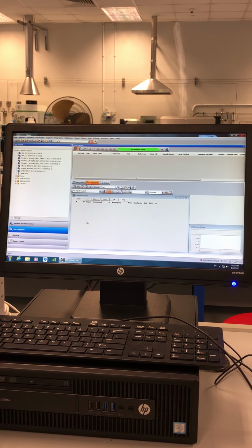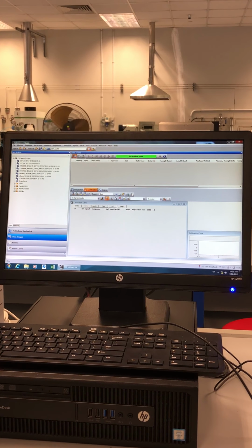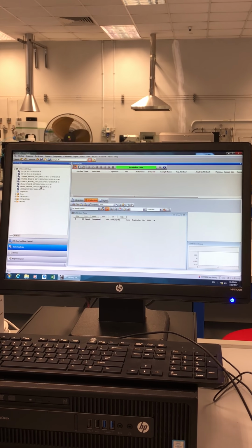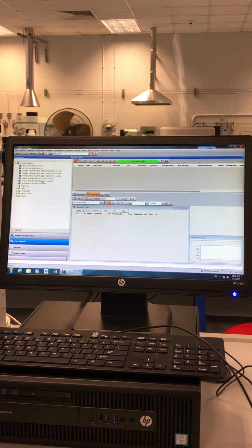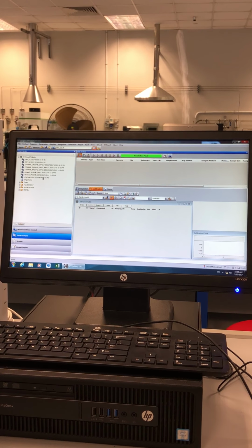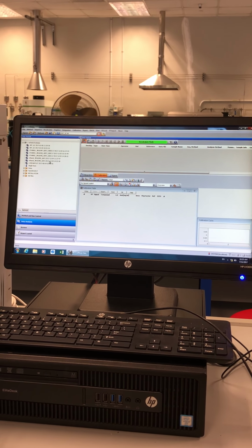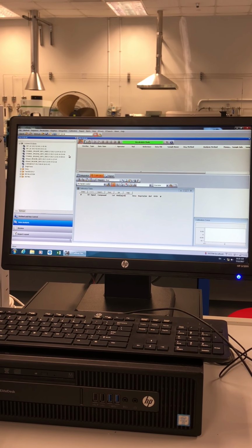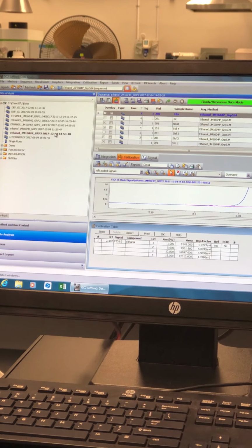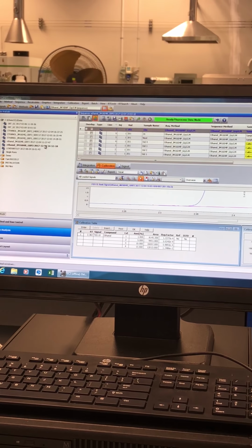Do you still remember what name you saved your results folder under? They are ethanol underscore class, group and date. So select the group and class that you have actually saved. Double click on it. Is it your file? Yeah.